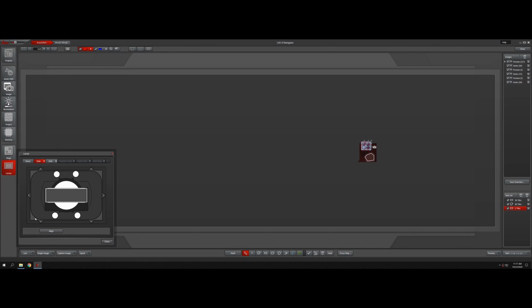But if your experiment really requires this type of automated imaging of the entire slide, then see me, we can place that holder and use this feature.